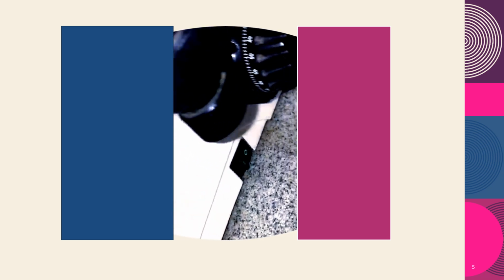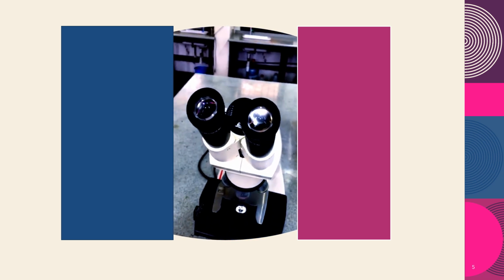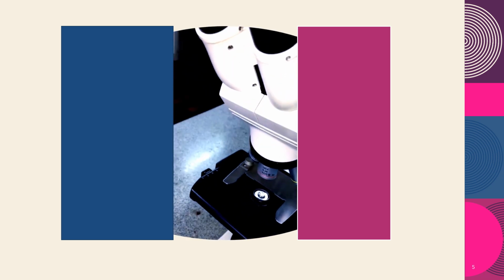Then we have the illuminator. We have the on and off switch, 0 for off, 1 for on. This is the base of the microscope. And then we have the knob for adjusting the brightness of the light that we are allowed through. So these are the objective lenses, the ocular lenses that we look through. These are the ocular lenses. If you observe carefully, you will see that the ocular lens has a magnification of ×10, and this is the cord that we connect to a light source.